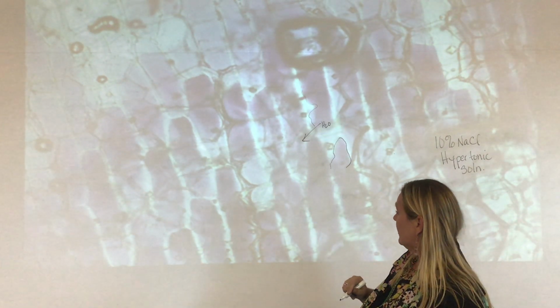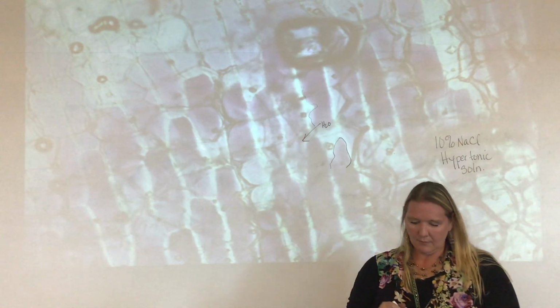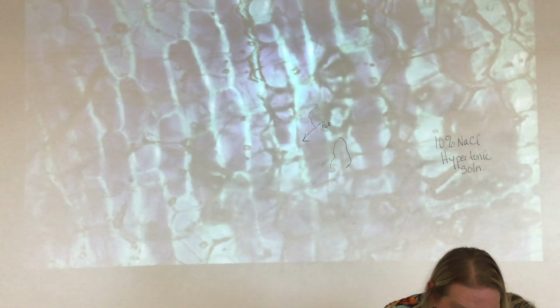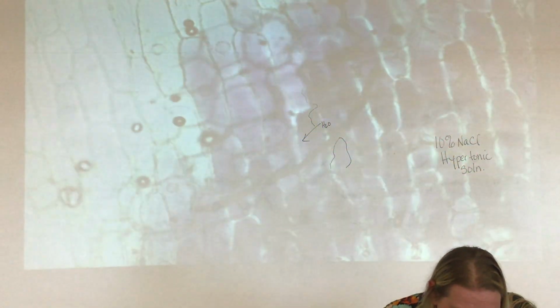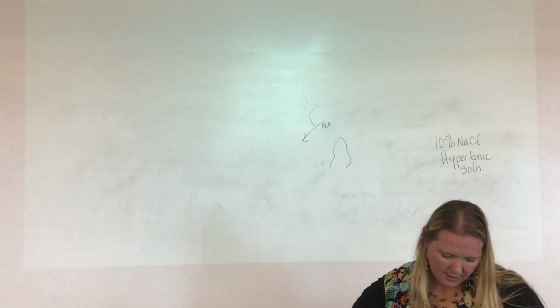I'm looking to see where it's shrinking the best and see if I can find a better area. I can tell that it's not quite as dramatic as what I want to see, so I'm going to look around just a little bit more, see how close I can get back to where I was.